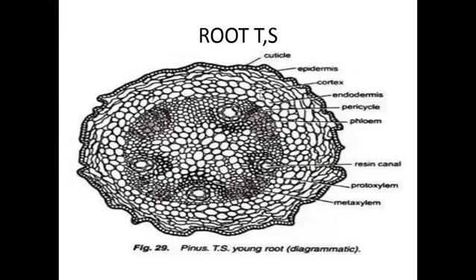The inner cortex is made by normal parenchyma tissue. They are loosely arranged and maintain intercellular spaces. These cells are helpful in storage of starch food material.